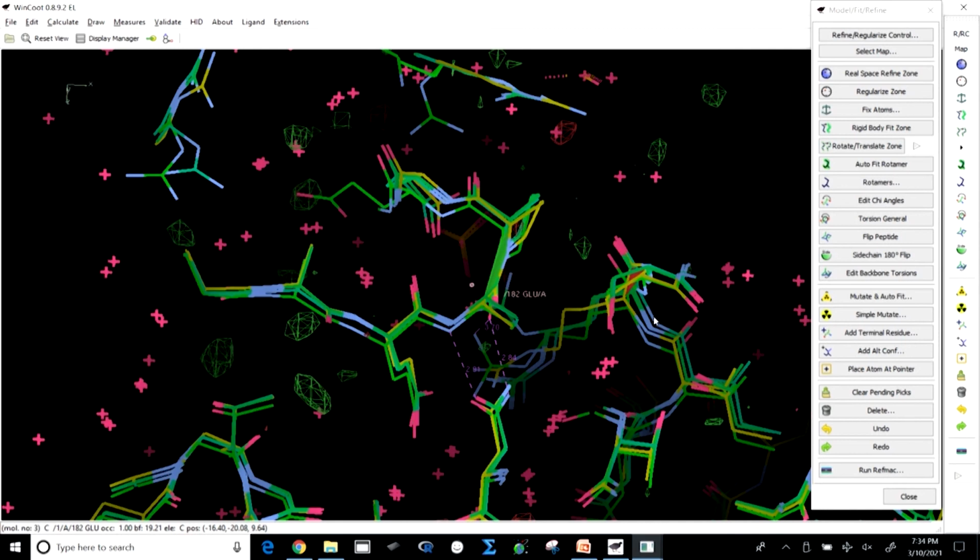But even if you do not have your own data, you could download the MTZ file, you could download the electron density map from crystallography, you could download electron density maps from electron microscopy and practice this computational part, which is an integrated part of structure development, and which only software platforms like COOT could give you.